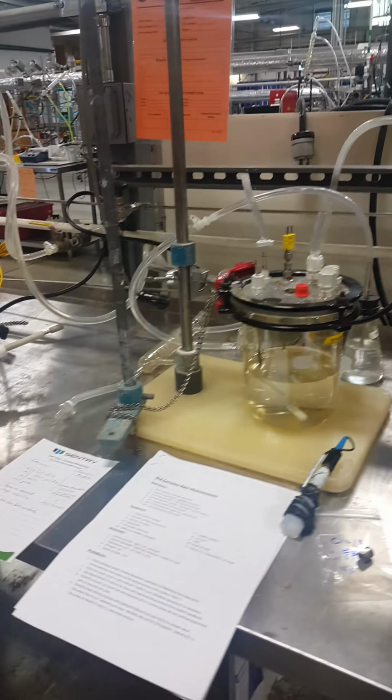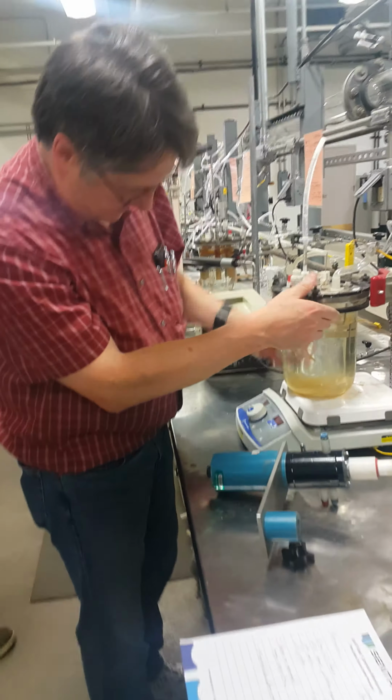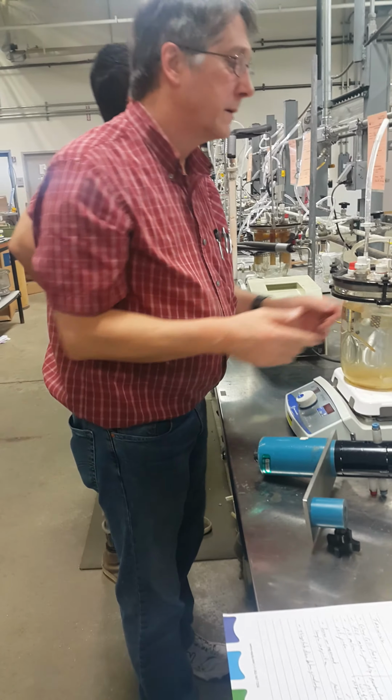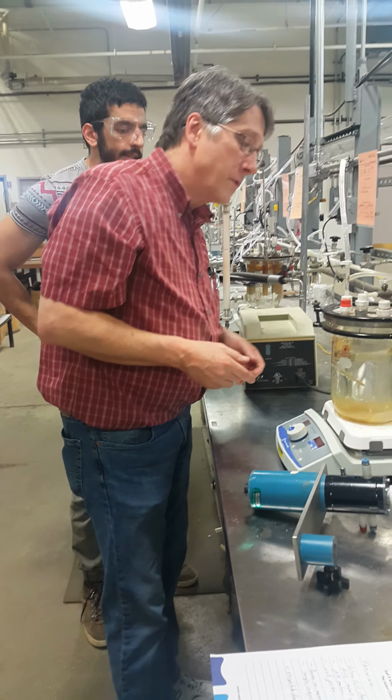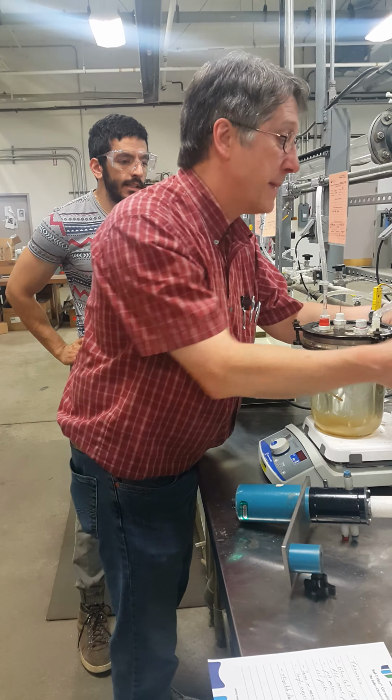The glass cell. We have special parts that go in the glass cell. Let me do this. Is this a full wall glass cell? No, it's just a single one. I'll mess with this one. So we'll have you guys take this apart and clean them too. I'll make you do some manual labor for me.